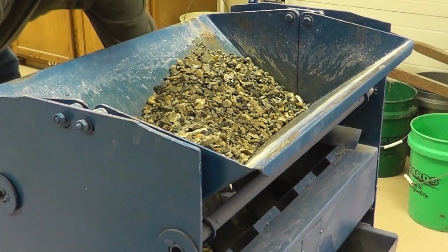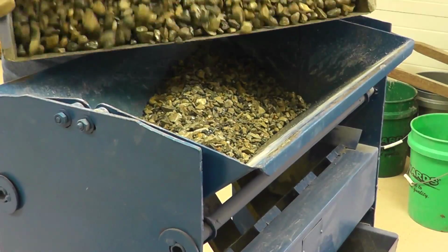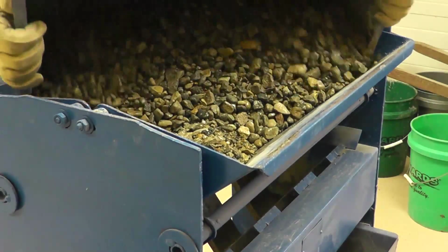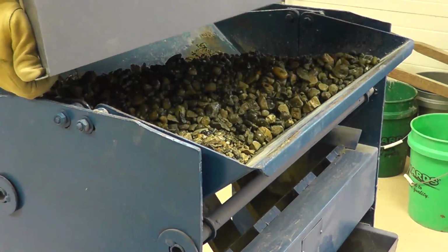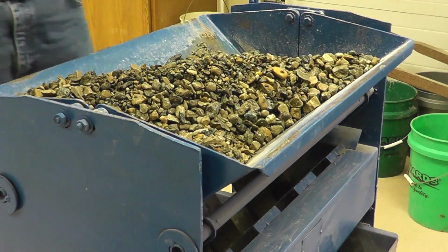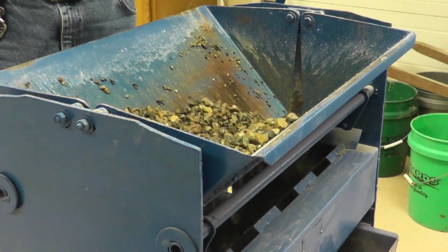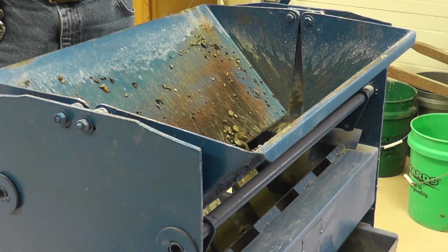Method A, mechanical splitter. Method A employs a mechanical splitting device where the field sample is dropped through a series of riffles, and each particle has an equal chance of dropping into one of the two receiving pans. The width of the chutes are adjustable and are set to a distance based on the nominal maximum particle size of the aggregate being tested.